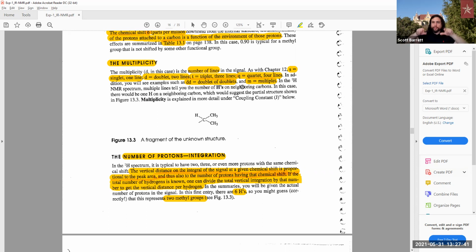You have a multiplet, you would see multiple different little peaks instead of very unique, like singlet, doublet, 2 peaks, triplet, you'd see a 3 peak situation. The multiplet just means any sort of additional 5, 6, 7 numbered peaks given for this instance.